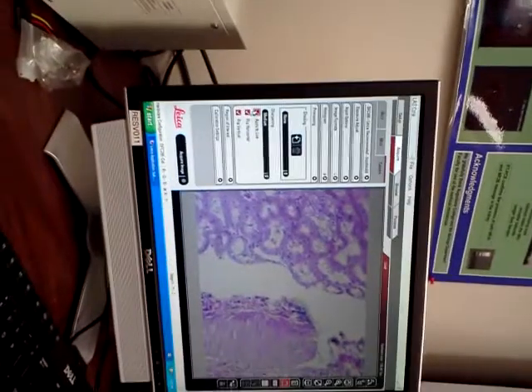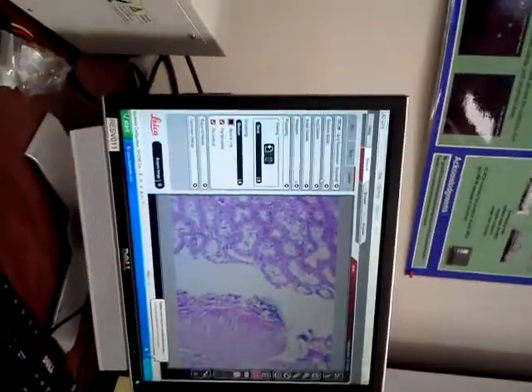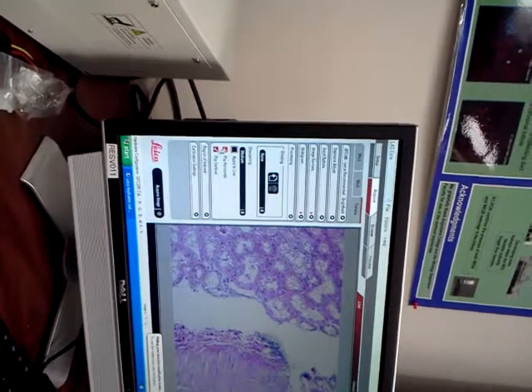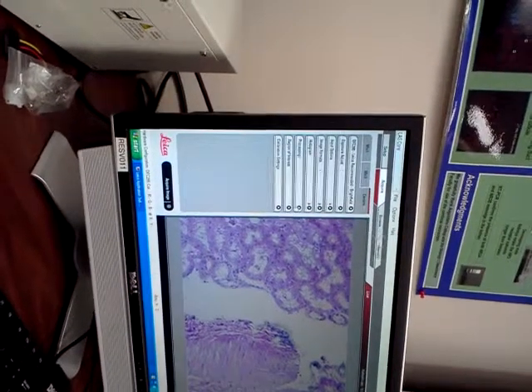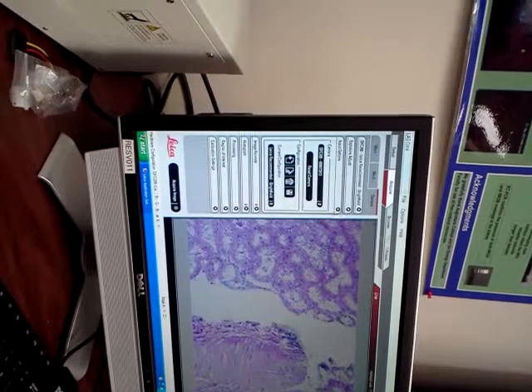That's more like what your acquired image is going to look like, actually a lot better, because the resolution is half. And then I did flip the image horizontally and vertically to match what we see through the eyepieces. That's saved automatically because I changed all this first and then I saved it in my configuration.